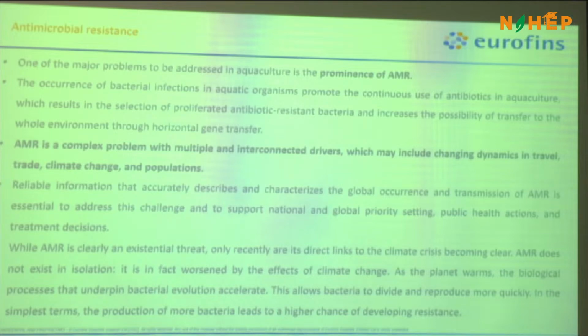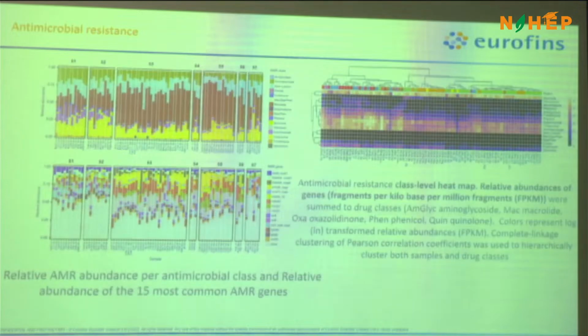Through metagenomics, we can take out the antibacterial resistance genes and tell which classes and gene families they belong to, and against which drugs the resistance is. There are databases from which we can fetch information for these types of results, and then we can give abundance. In this also we can give the abundance in each sample, what level of antibacterial resistance is there and against what.